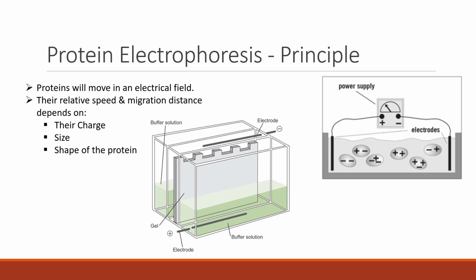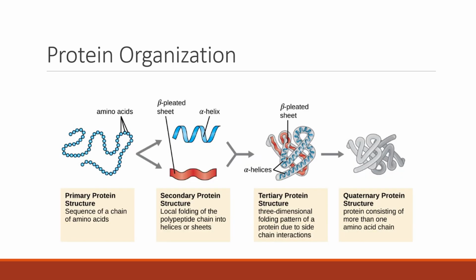So with the same idea as DNA, we have protein electrophoresis, where we can put a collection of proteins into an electric field, and those proteins will migrate or move through that electric field depending on their particular charge, their size, and even the shape of the protein.